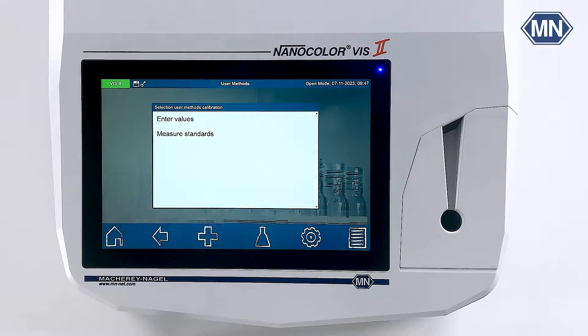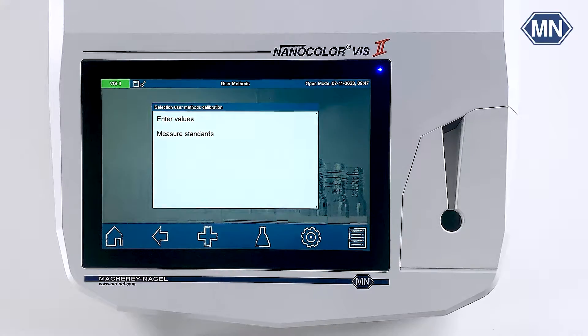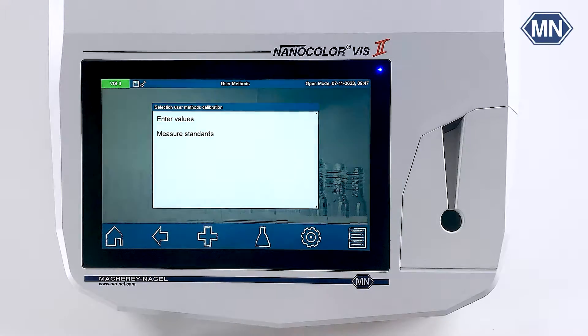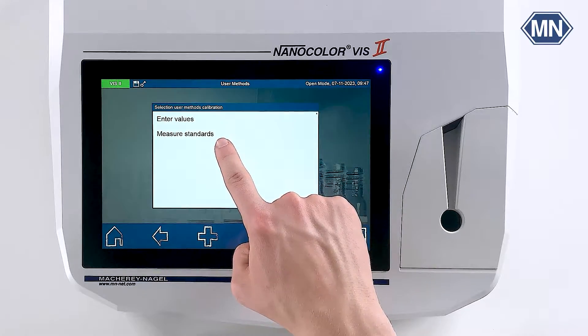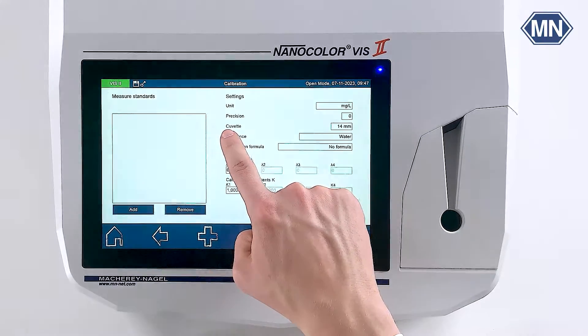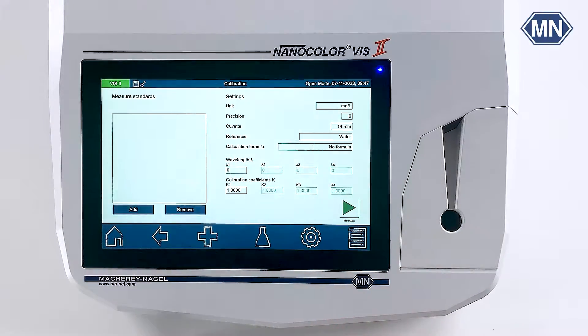In our case, we have freshly prepared a series of standards with known concentration. To measure the respective absorbance, we will therefore use the measure standards menu.